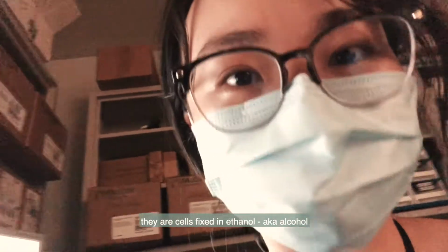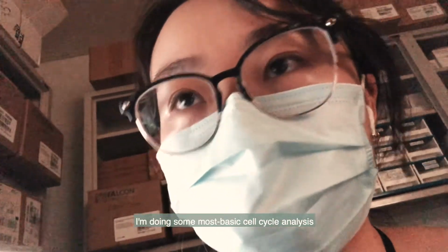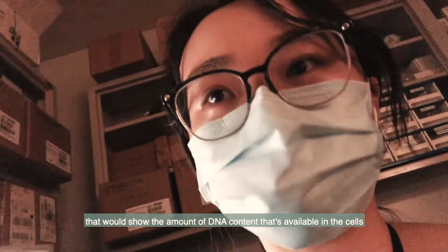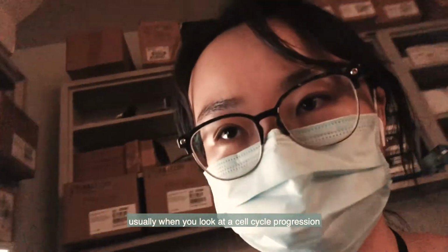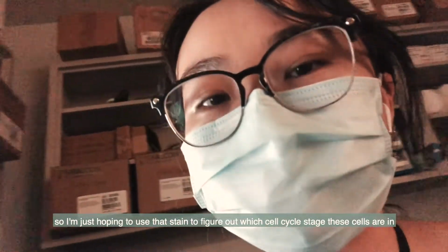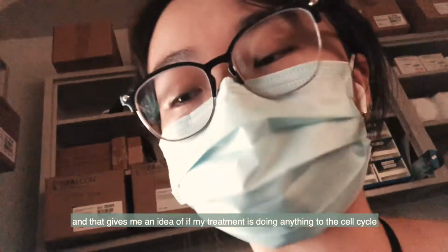They are cells that are fixed in ethanol, aka alcohol, and then we suspend it in a staining solution. So I am doing some most basic cell cycle analyses, which means that I'm staining them with a certain chemical that would show the amount of DNA content available in the cells. And usually when you look at a cell cycle progression, you can see that DNA content multiplies and then drops back down. So I'm just hoping to use that stain to figure out which cell cycle stage these cells are in. And that gives me an idea of if my treatment is doing anything to the cell cycle.